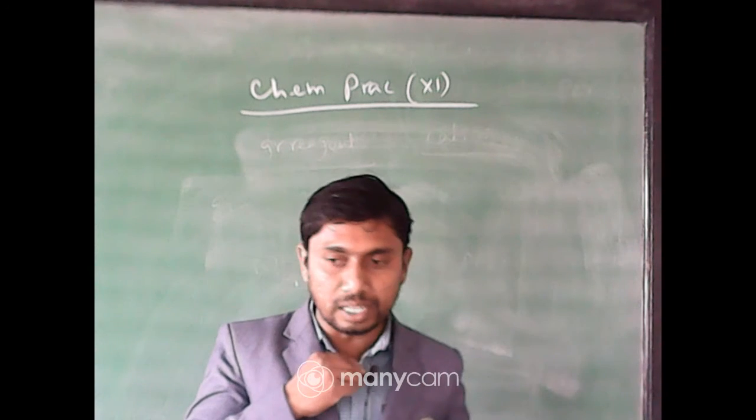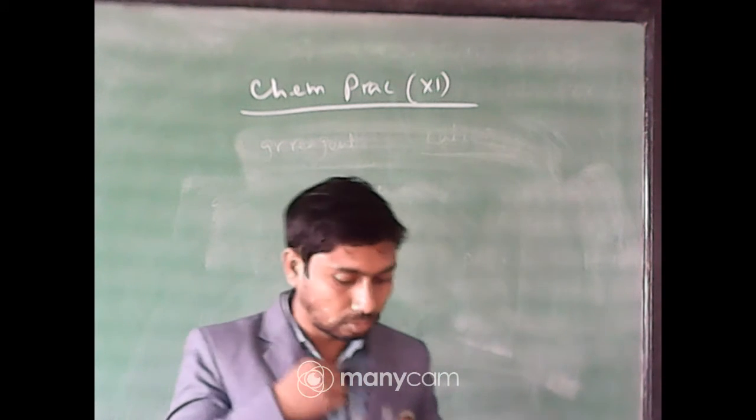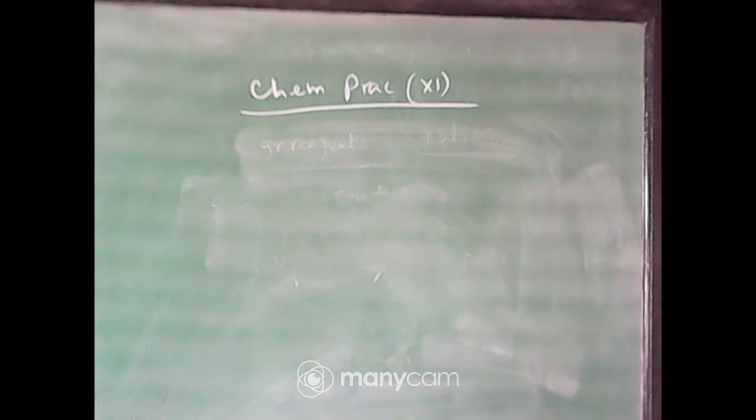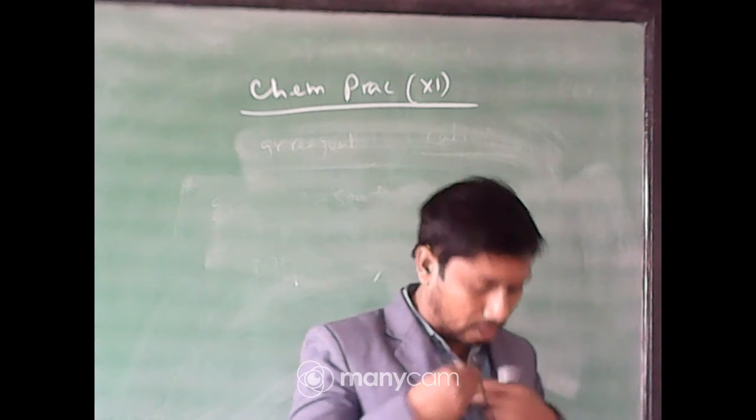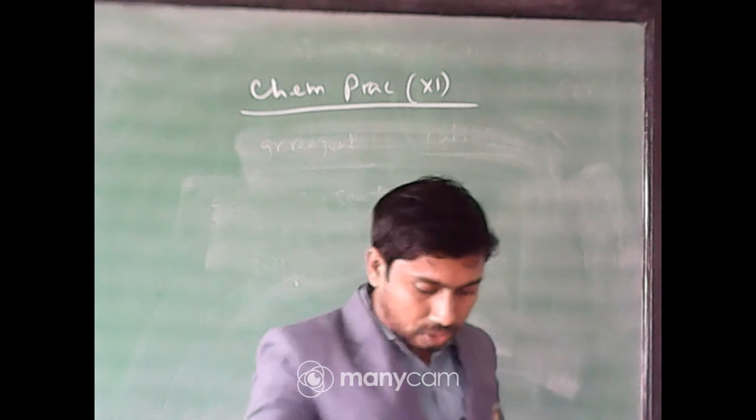So, look at the test for aluminium. You have to take the salt by using the spatula.